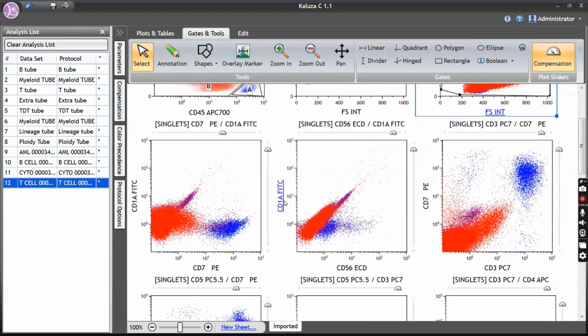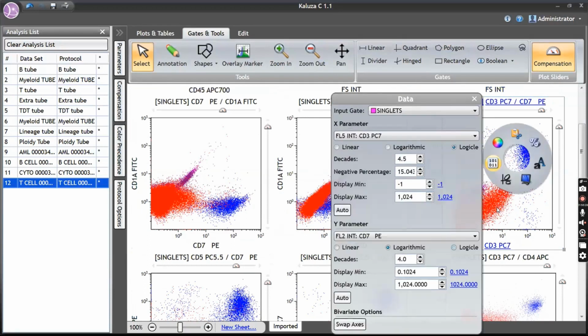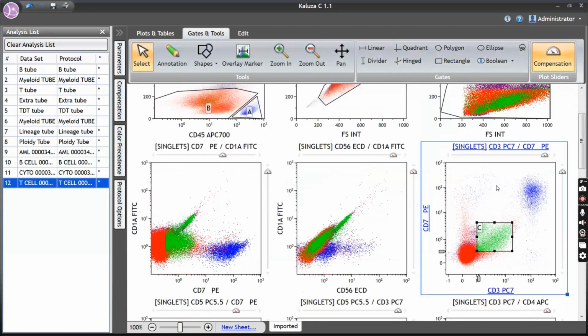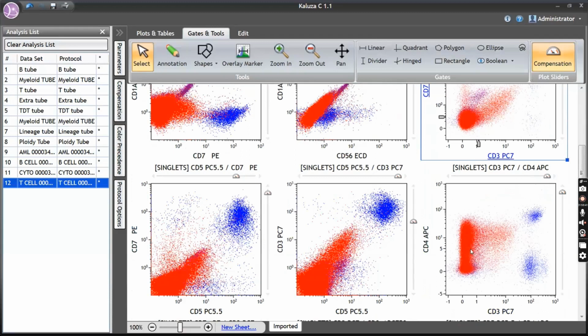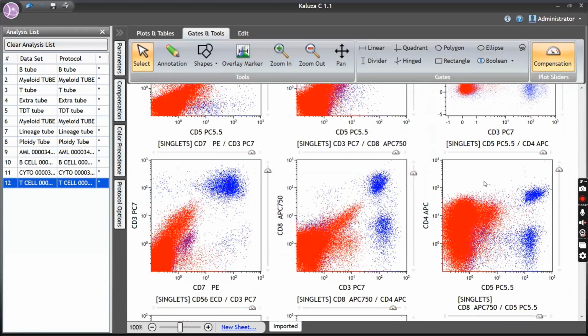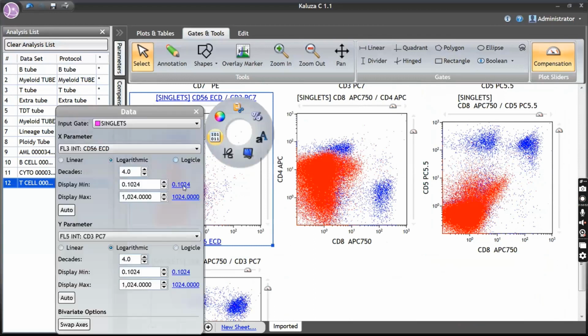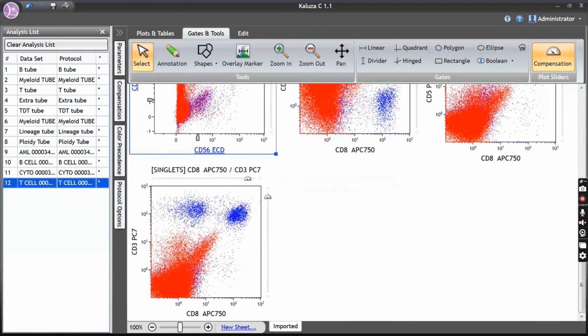Okay. Now let's see. 1A is negative, 56 is negative, 7 is all negative. This could be some junk coming into that, so I don't consider that. 4 is positive, in a variable pattern. That is interesting. CD3 looks positive, but I'm not very sure with it.